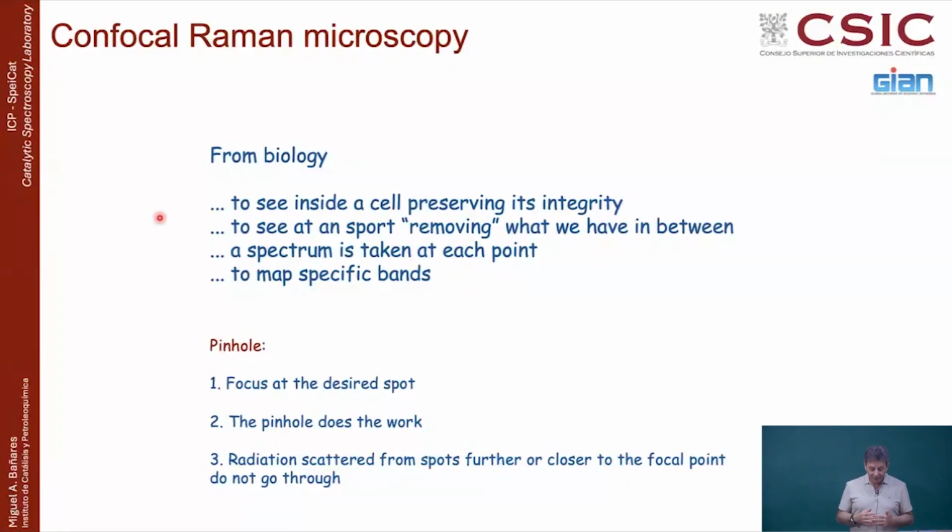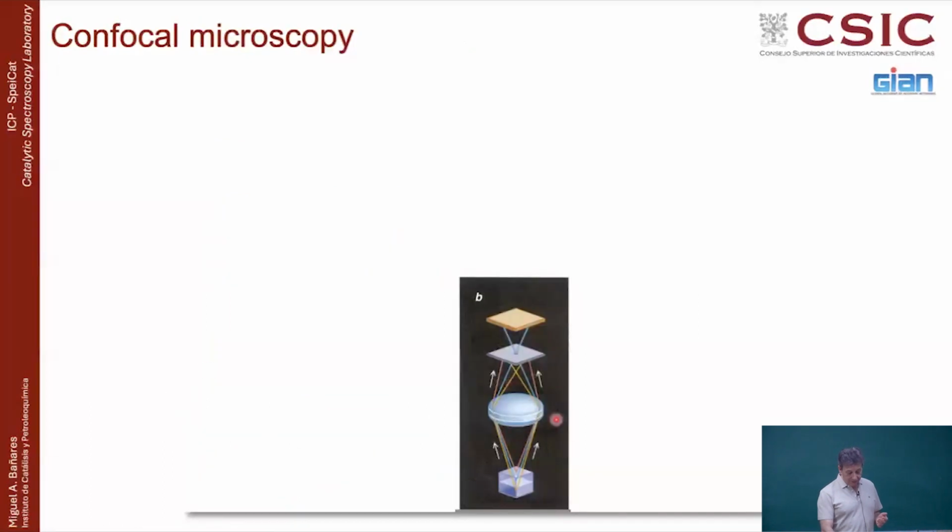And all the time the magic occurs because of something as simple, conceptually, as a pinhole. Now you will see how it is. And then you can focus at the desired spot, and this pinhole is what really makes it work. So this is the concept of confocal microscopy.